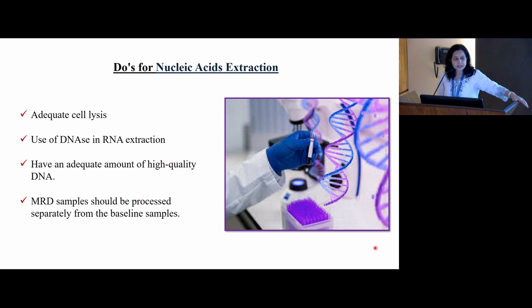So for nucleic acid extractions, you have to take care at the time of lysis. If you are doing RNA extraction, use DNase properly. If you are running experiments in which you need a higher amount of DNA, there are a number of kits available in the market, so you have to design your protocol accordingly, select the kit with which you get proper results, and get a good quantity of DNA.